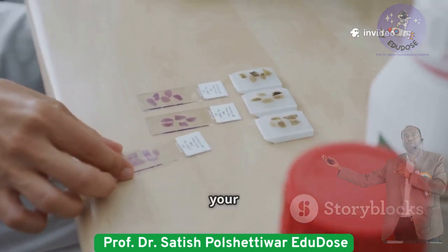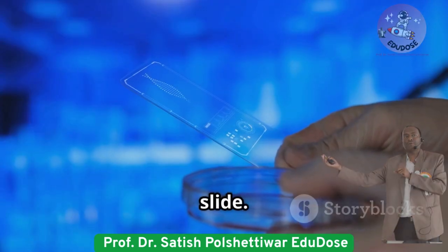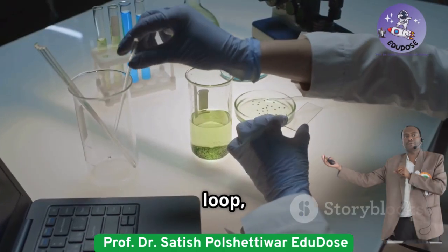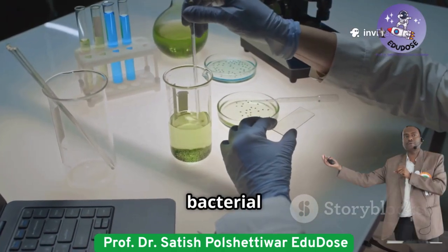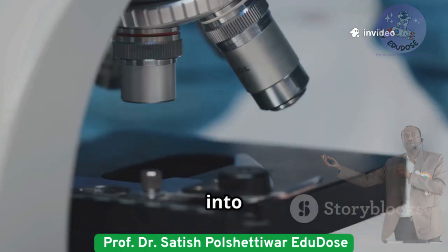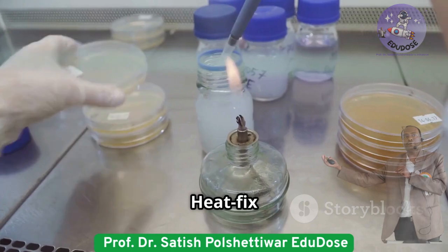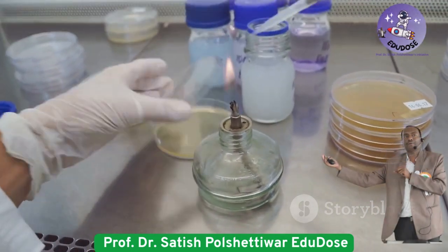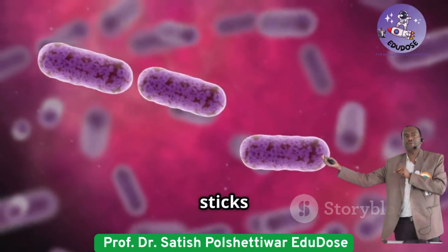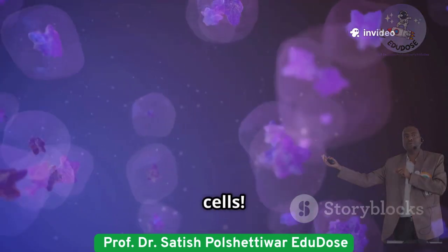So how do you prep your bacteria for staining? First, grab a clean glass slide. With a sterile loop, transfer a tiny amount of bacterial culture, either from a broth or a colony. Spread it into a thin smear on the slide, then let it air dry. Heat fix it gently over a flame. This step kills the bacteria and sticks them to the slide. Just don't overheat or you'll mess up the cells.